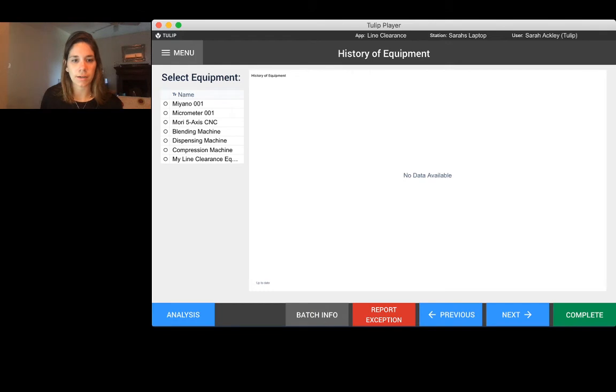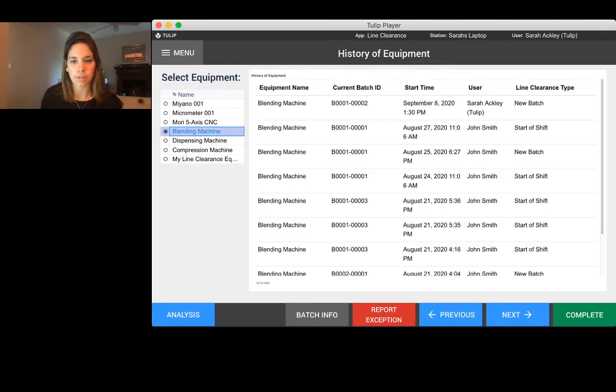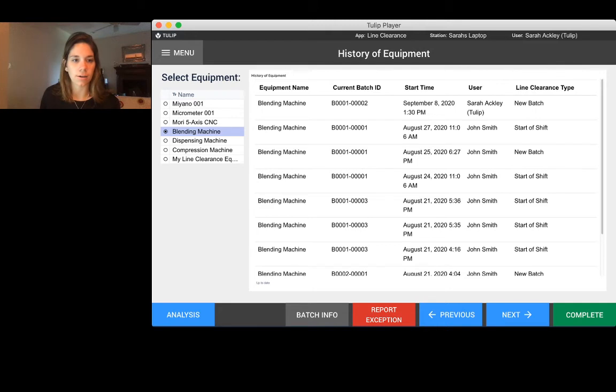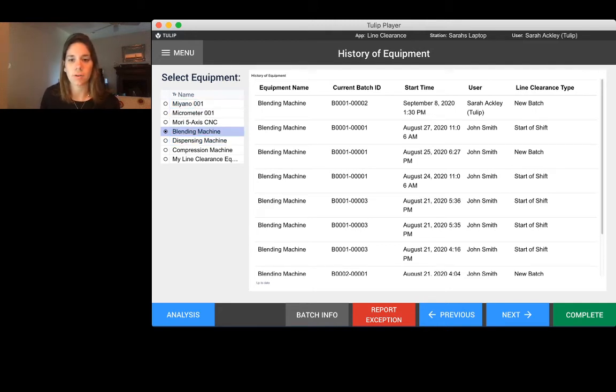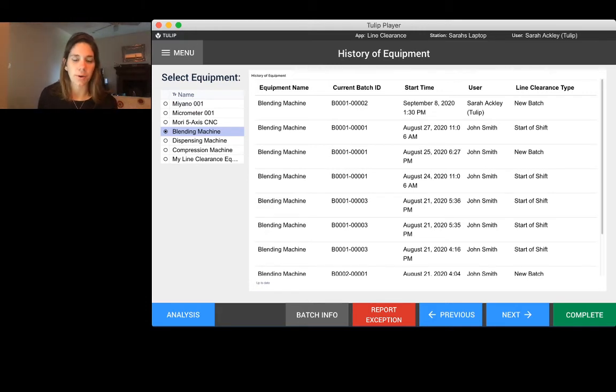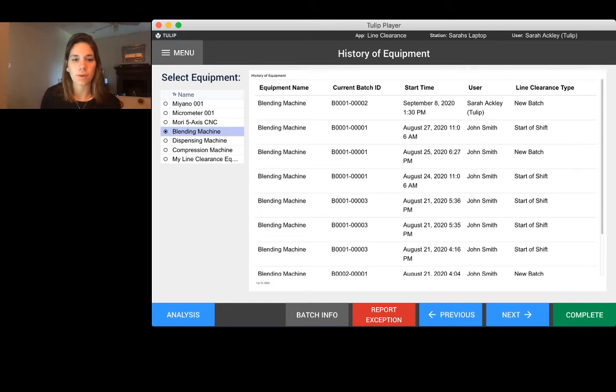We could come in here and if we select the blending machine, we can see the full history of line clearances that has been performed on that particular machine. We could see that on August 27th it ran 001, and now today on September 8th we did a changeover with this new batch that I just ran.